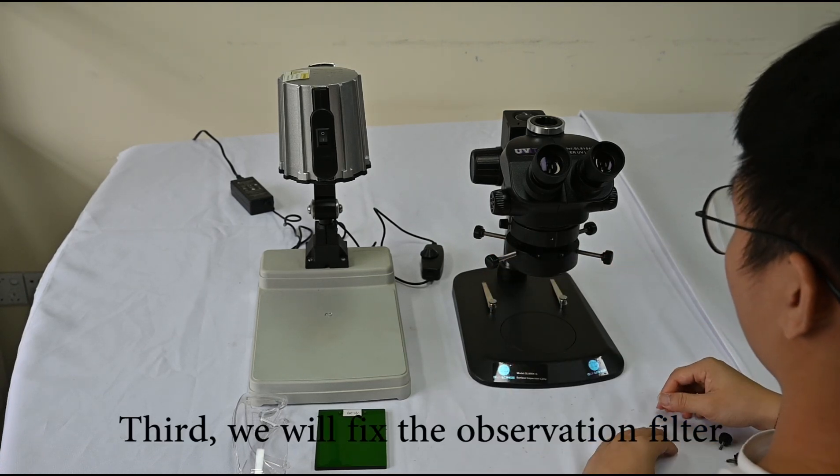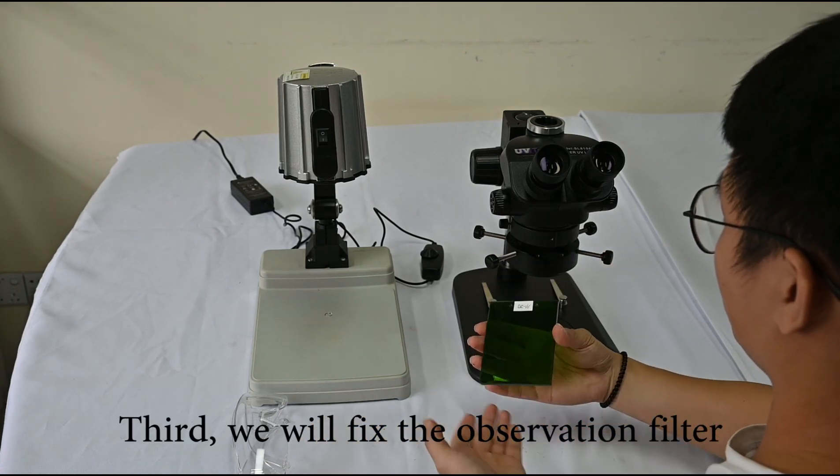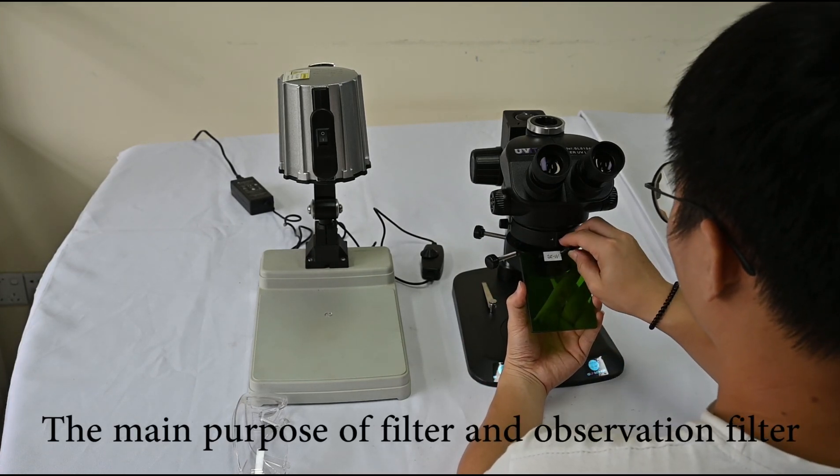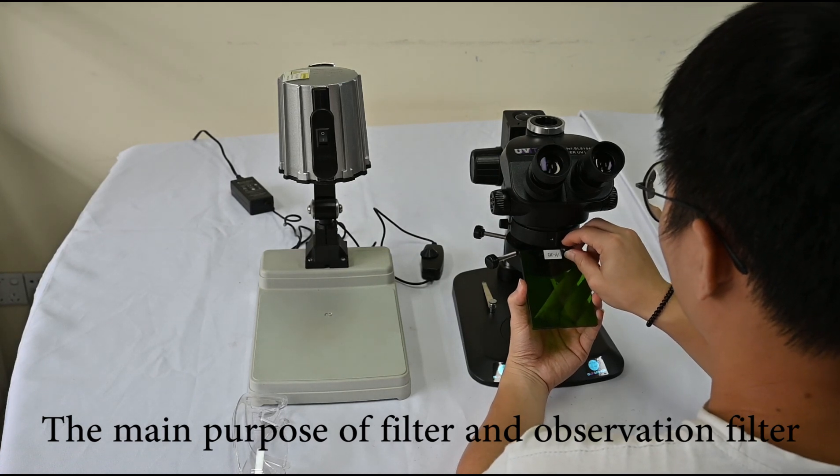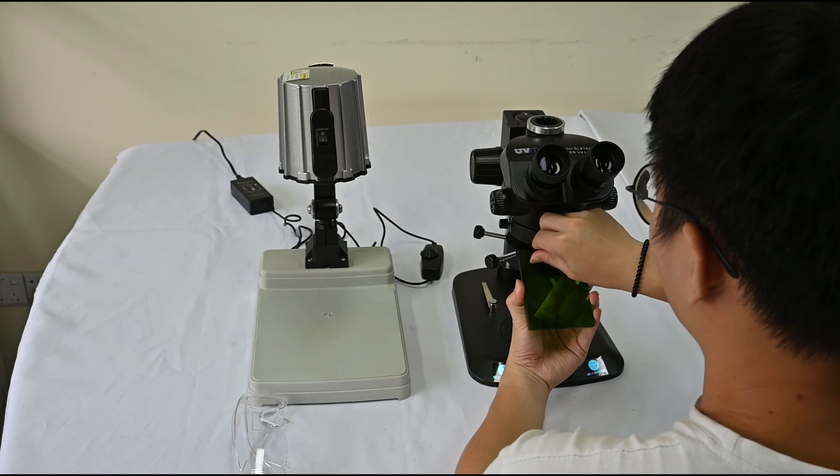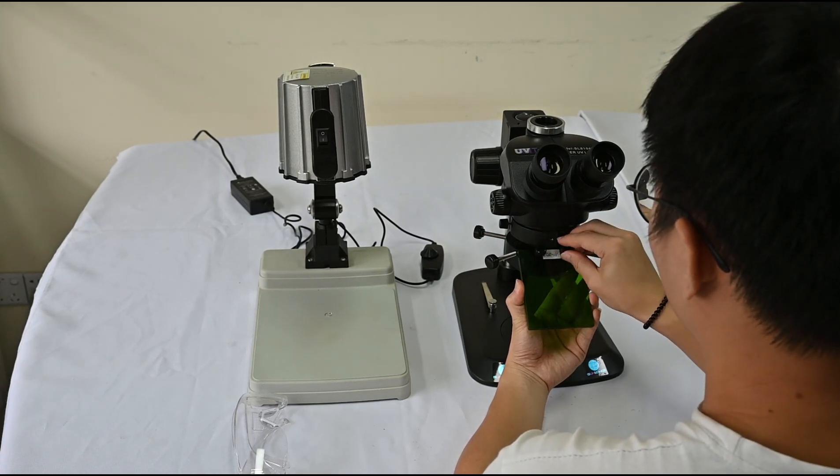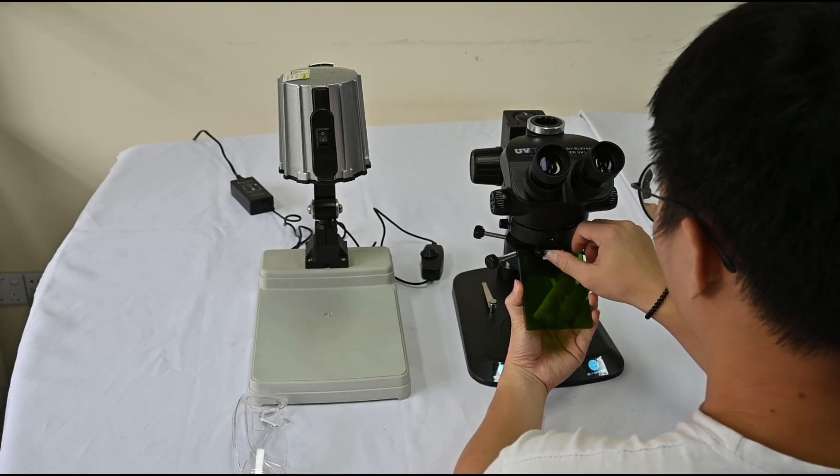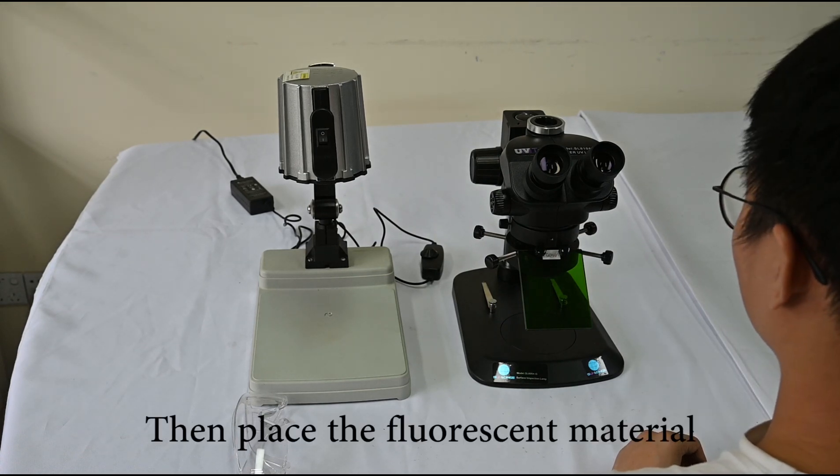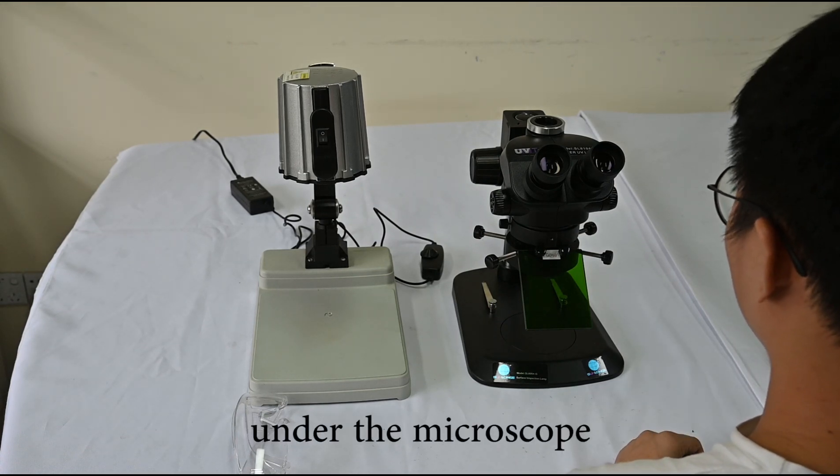Third, we will fix the observation filter. The main purpose of the filter and the observation filter is to block the stray light. Then, place the fluorescent material under the microscope.